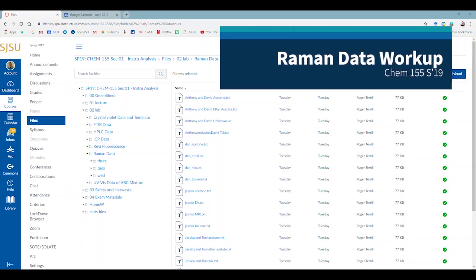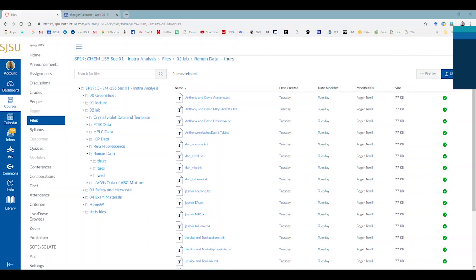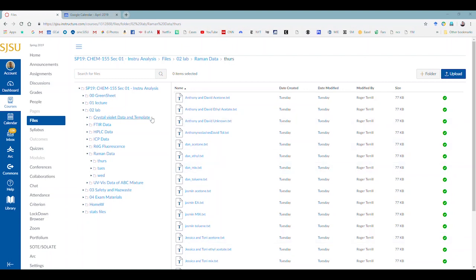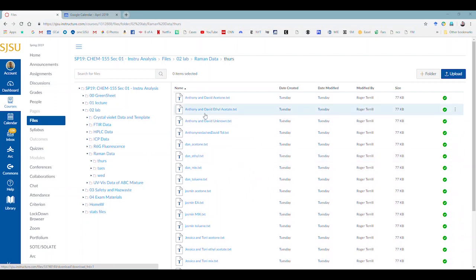This is a video on how to do the Raman data workup. First of all, the data are found in the file section under Raman data and I've downloaded all these, or actually I uploaded all these so I have these files.